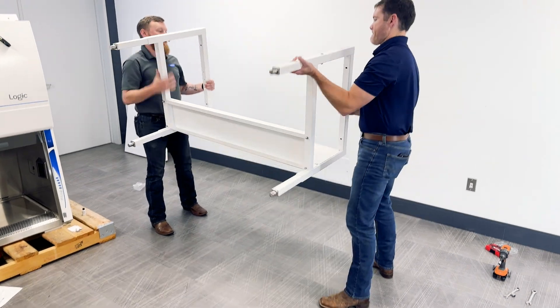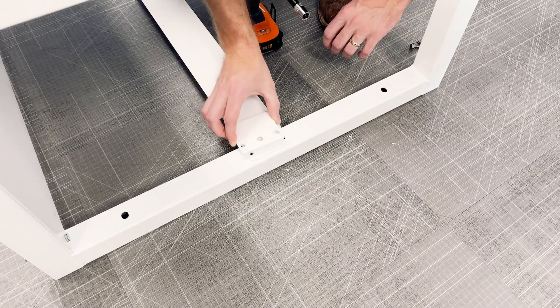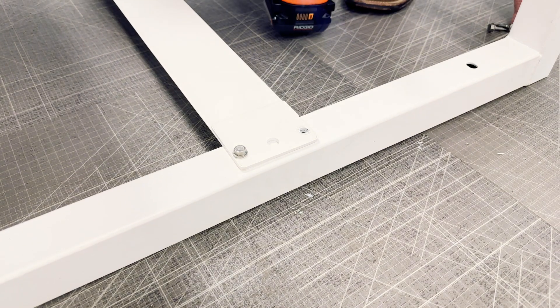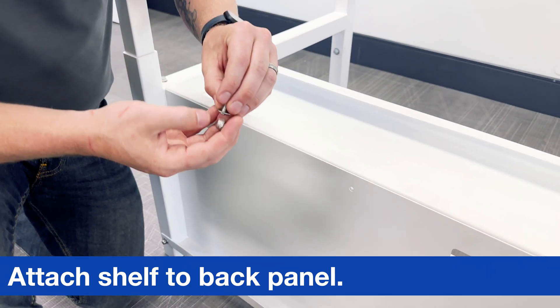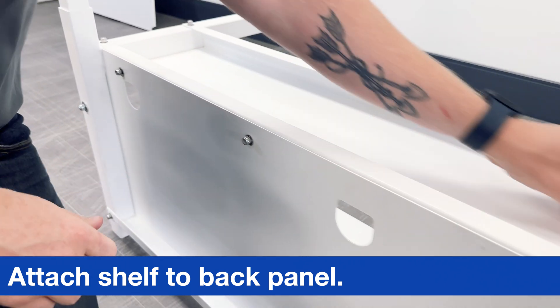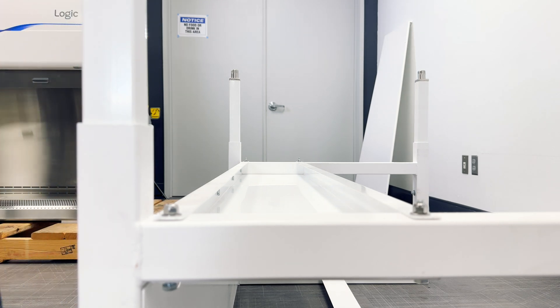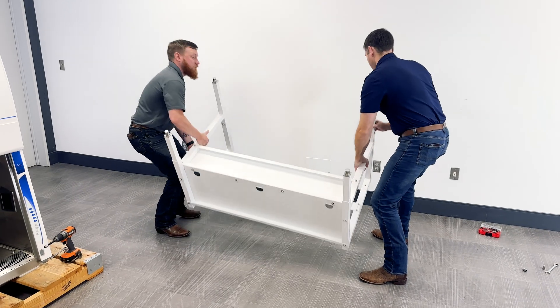Carefully flip the stand upside down. Next, attach the top support and top support plates to the underside of the side assemblies using the four included self-tapping screws. Ensure that the screws are straight as you tighten the top support to the base stand. Complete the stand by tightening all bolts before turning it upright. Move the base stand to the desired area.